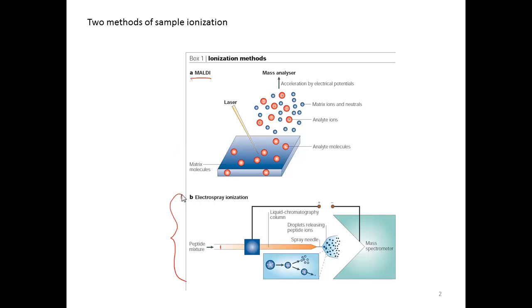The other type of mass spectrometry goes by various names: electrospray, nanospray, tandem mass spectrometry, ion trap mass spectrometry, FT or ICR mass spectrometry. These are all going to be essentially the same type of process. So if you get these two straight, you'll basically understand almost every kind.